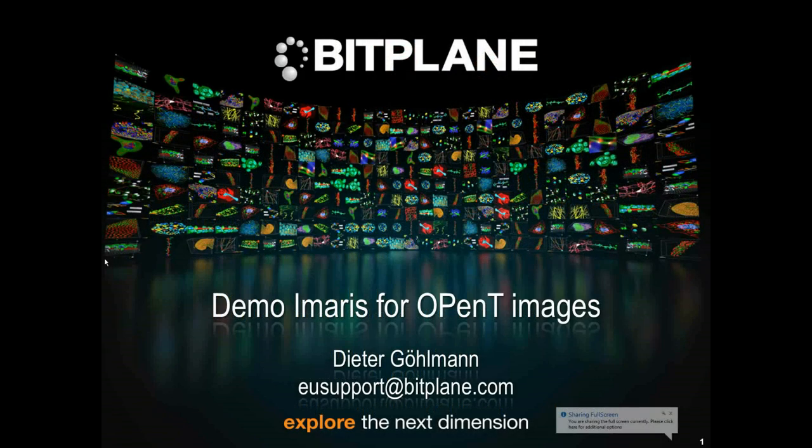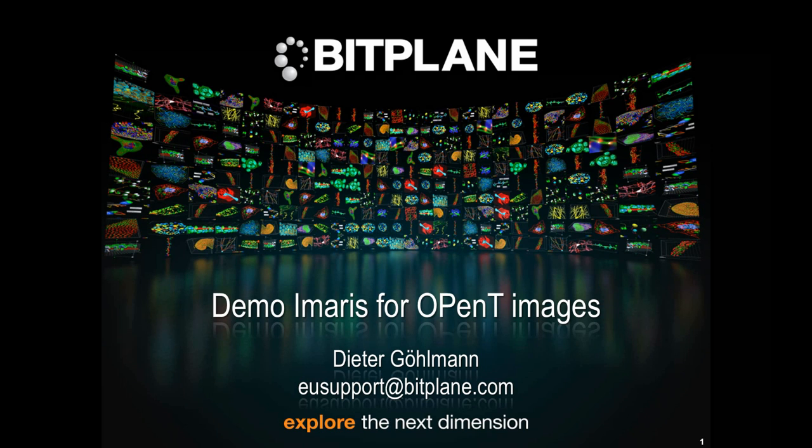So now we have Dieter, and he's going to show you a couple of slides, I think only really a couple of slides, and then move to Imaris itself and spend some time there to show some of Gabby's images being segmented and analyzed and how they can be fully analyzed using Imaris.